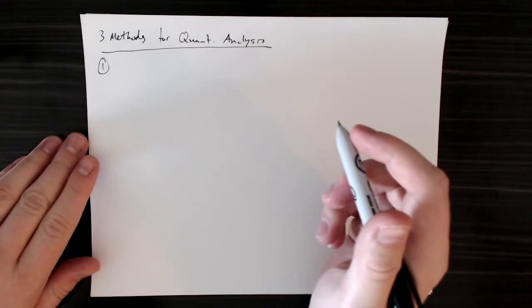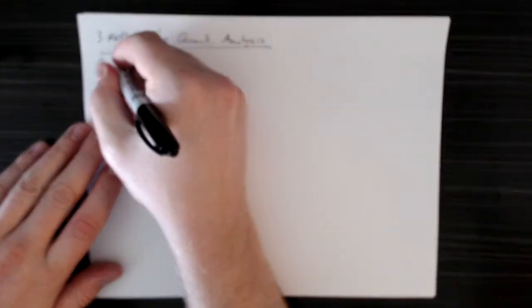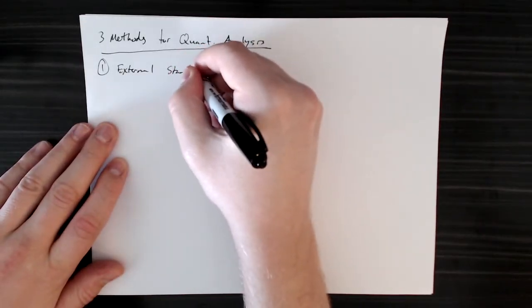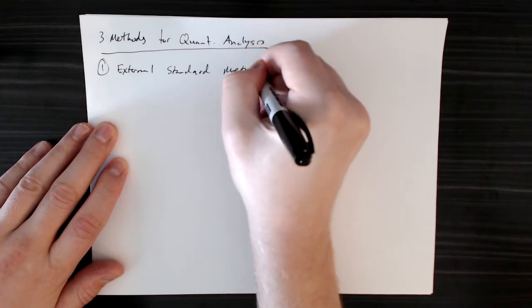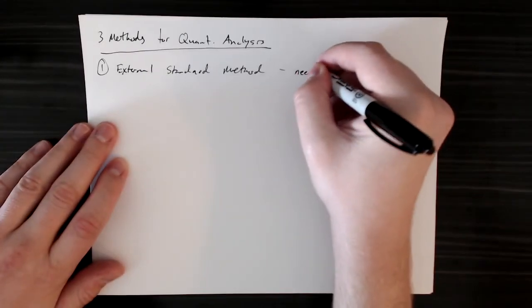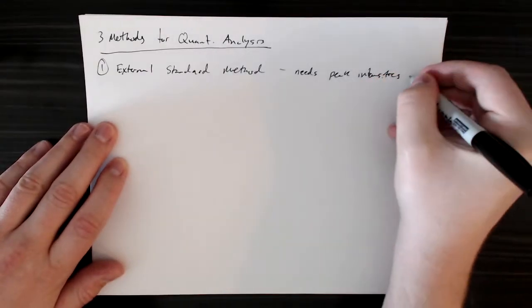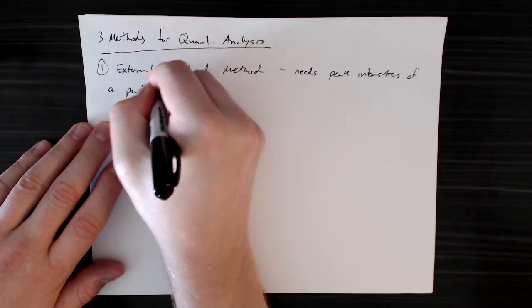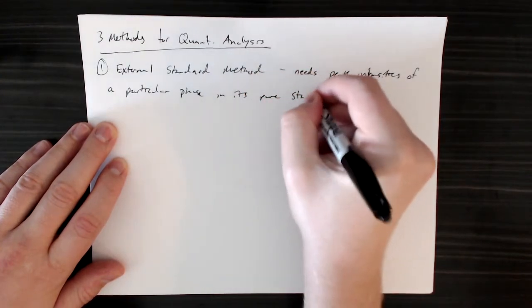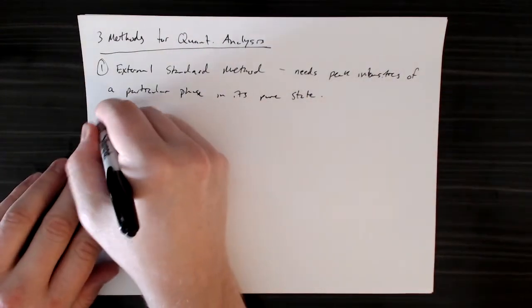Okay, so we're going to talk about three methods that we can use to do this quantitative analysis. The first is an external standard method. This method needs peak intensities of a particular phase in its pure state. So this isn't always available, so there are other options.